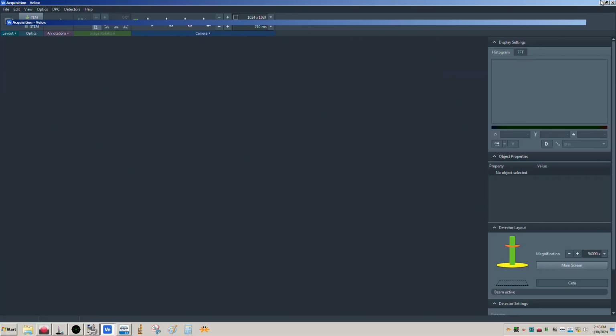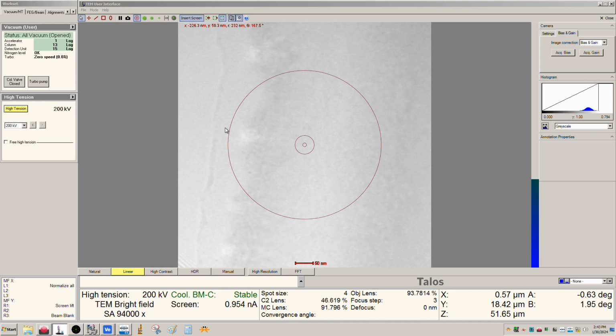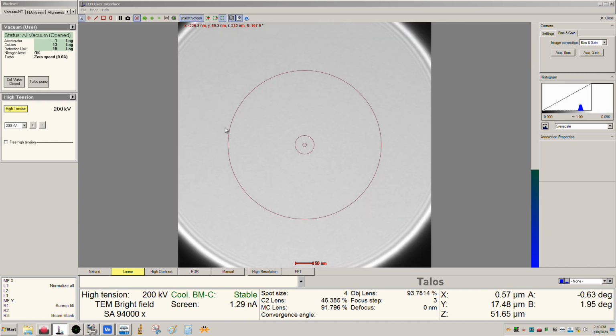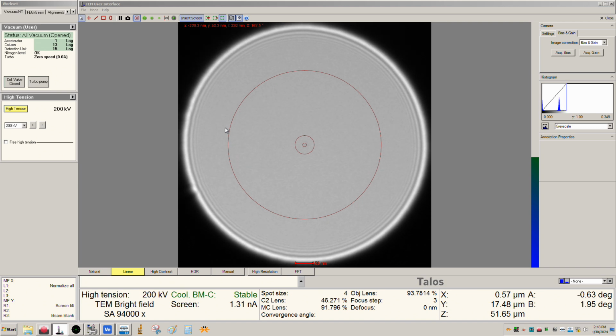But one thing you should appreciate is that at the voltages at which we perform STEM, so tens of kV through hundreds of kV, you are going to cause damage to your samples. There are lots of different kinds of beam-induced damage that can occur to your samples. When we talk about the physical sciences, we're mainly concerned, and again, not to say this is the only type, but mainly we're concerned with what's called knock-on damage.